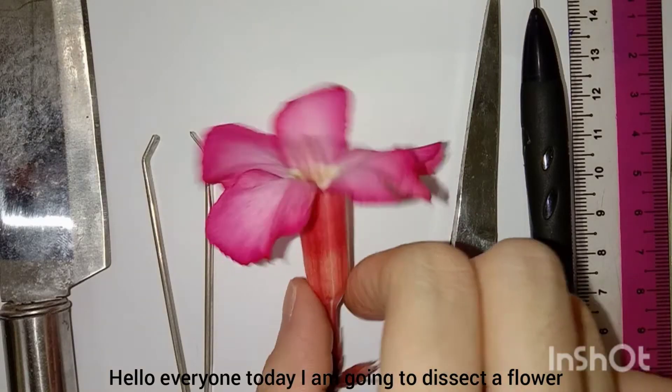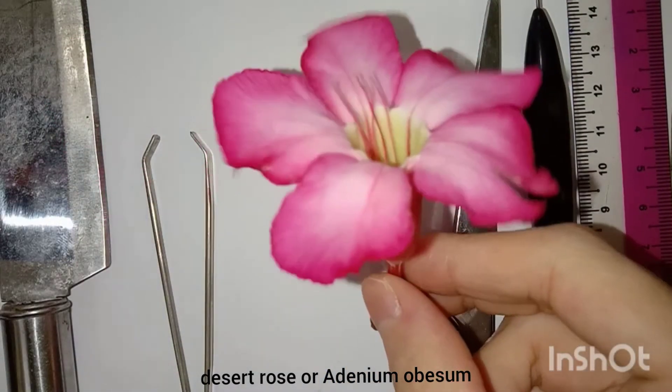Hello everyone, today I am going to dissect a flower, desert rose or Adenium obesum.